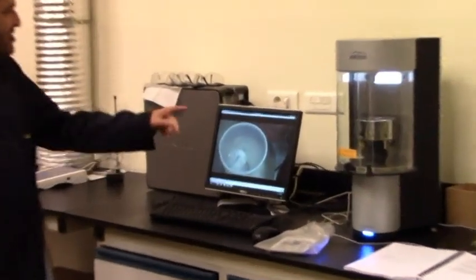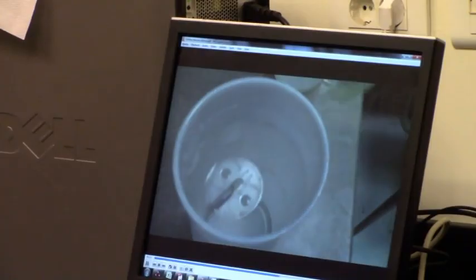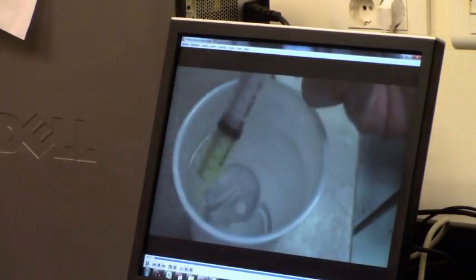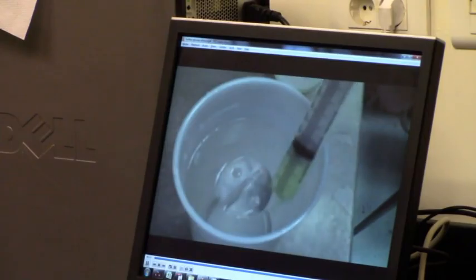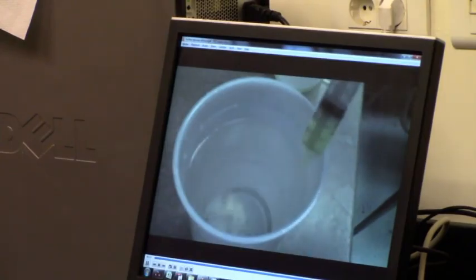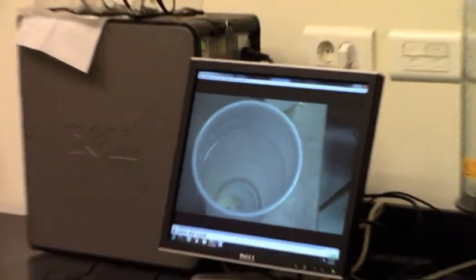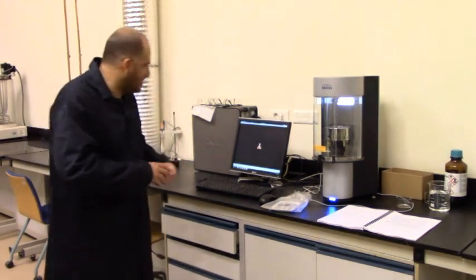Because this gentleman injects some fluid, probably soap, which is like a surfactant, to reduce the surface tension. We'll see what will happen to this metallic object. It sinks. So it is not a matter of density, it's a matter of surface tension that has been reduced too much, to the extent that it cannot hold the plate anymore.